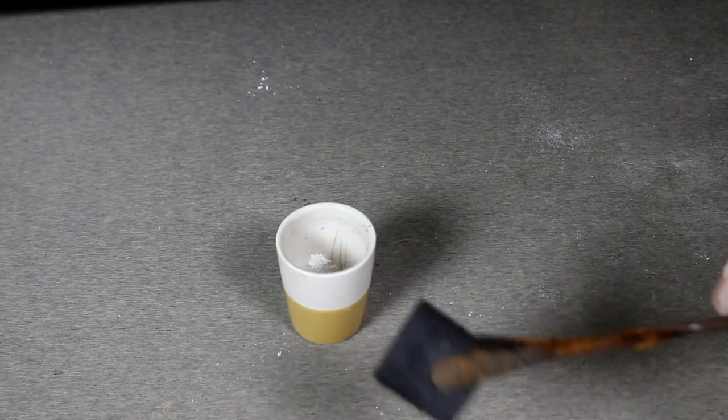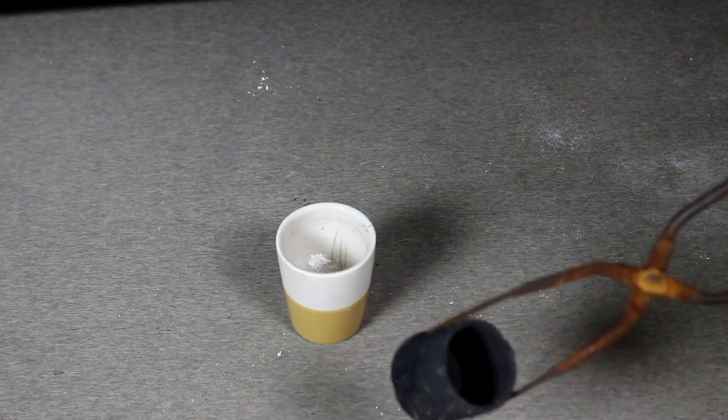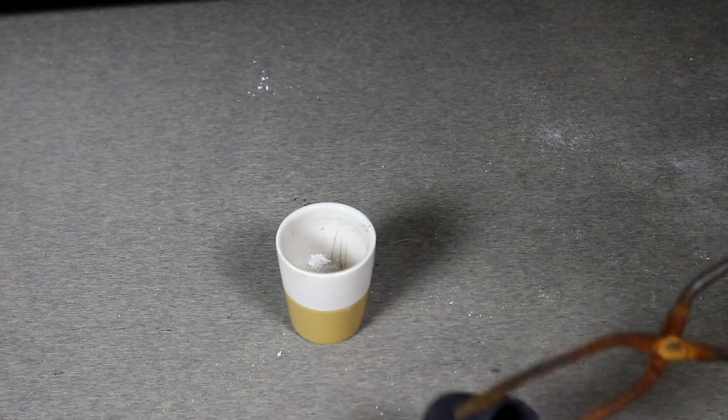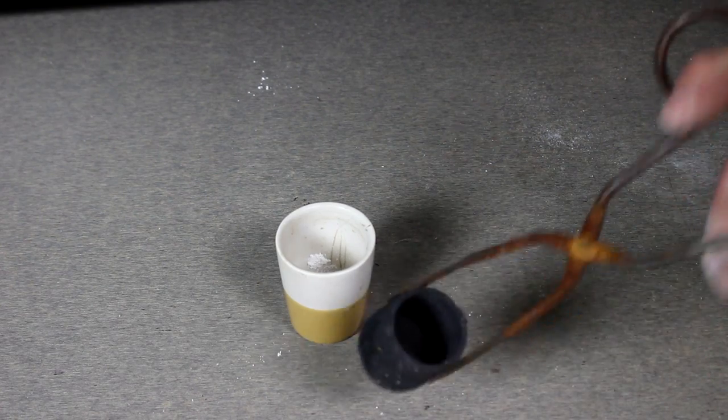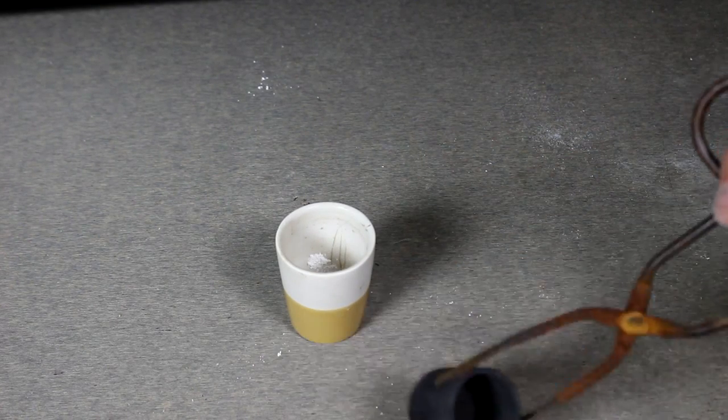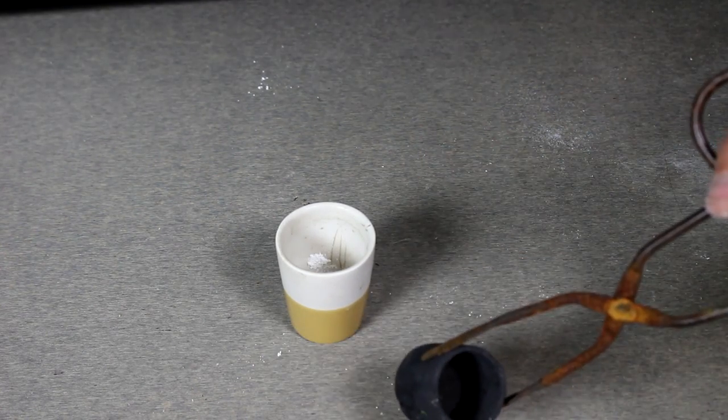I of course can't use a graphite crucible because the graphite will dissolve into the glass with carbon resulting in a product which is black or some off color, which is not really what I want.